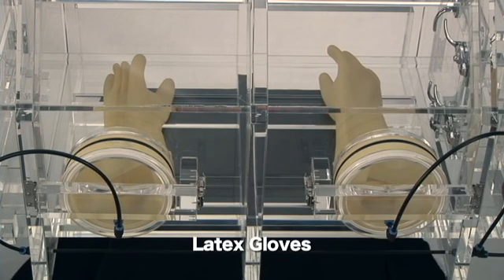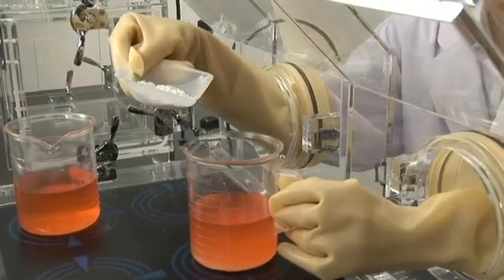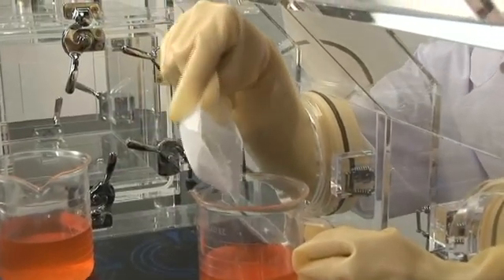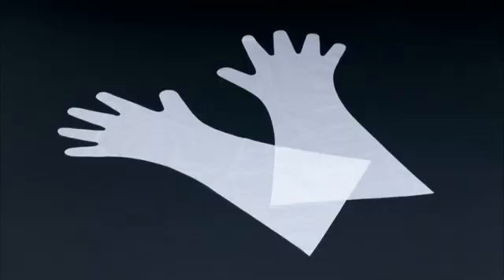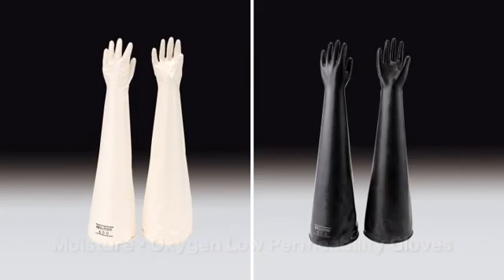There are latex gloves which have high flexibility and excellent workability. There is an option for inner gloves for replacement and moisture, oxygen low permeability.